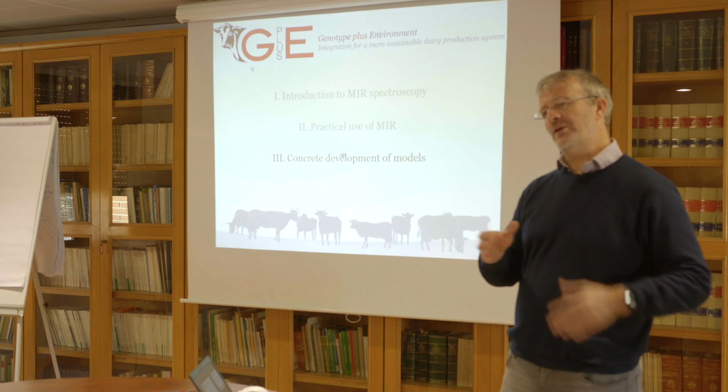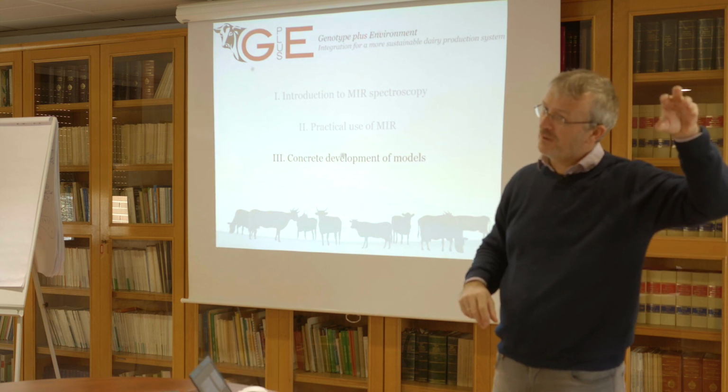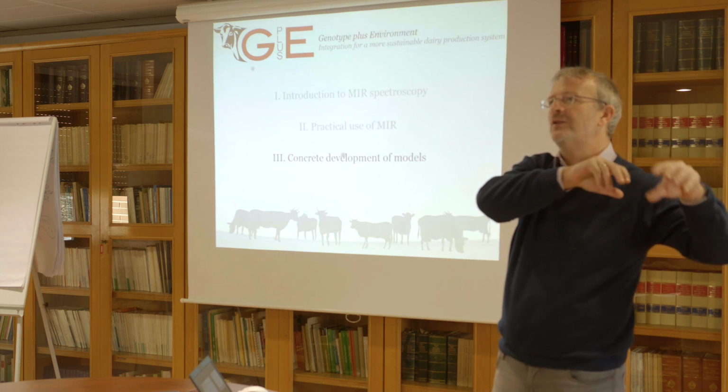The idea, you create coefficient in a fixed moment during a period, and when you build your database, you still take into account the fact that you need to use the coefficient of calibration of the moment that you measure the spectra. You don't need to use the new coefficient to use it on the old spectra. It's only for the spectra that you use at the moment that you measure.